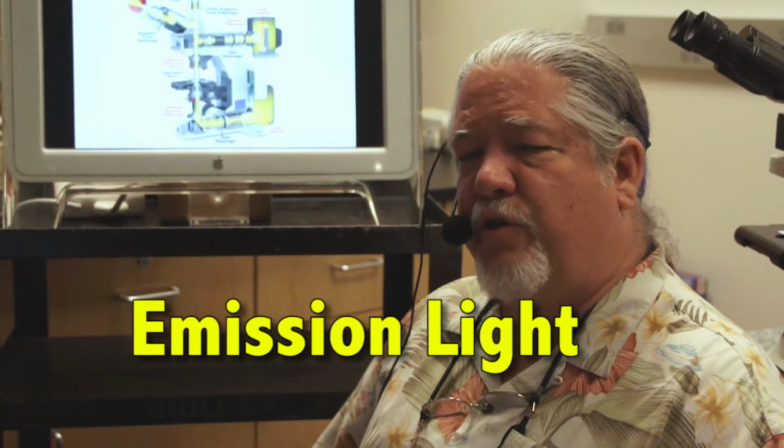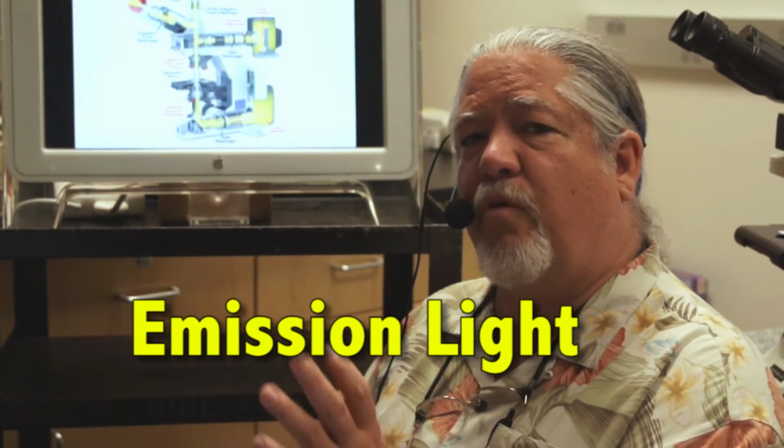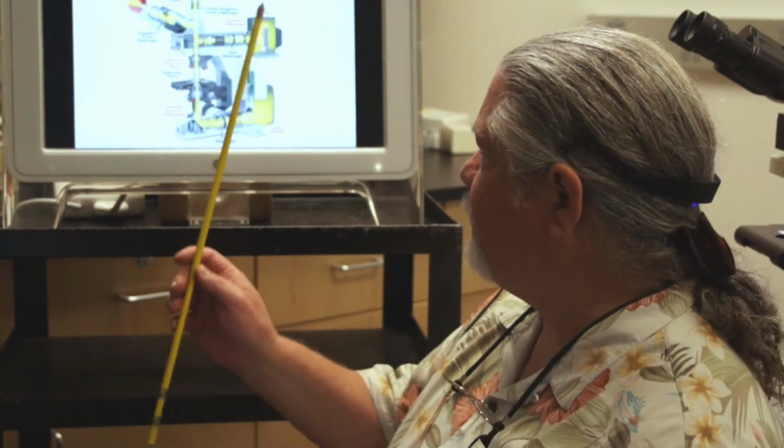Now, a lot of specimens will autofluoresce. You can excite them with a bright light like 490 nanometers, and they will automatically give off light, or emit light. That's called emission light. Usually the emission light is a longer wavelength than the excitation light, and we'll talk more about that later.